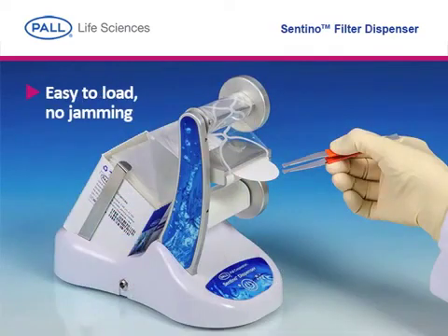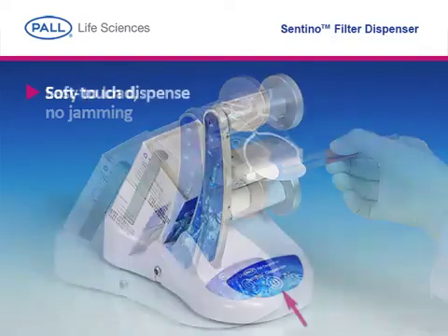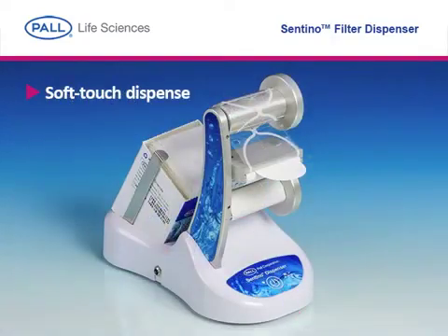Special care was put into the engineering of the product to provide easy, foolproof loading with reliable dispense time after time. The soft touch keypad provides one disk of membrane at the touch of a button.